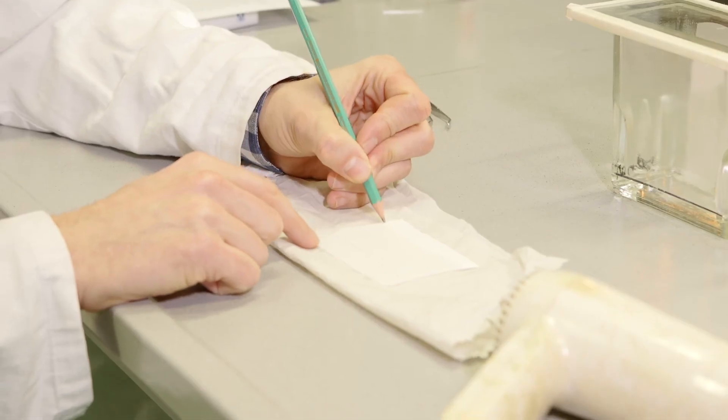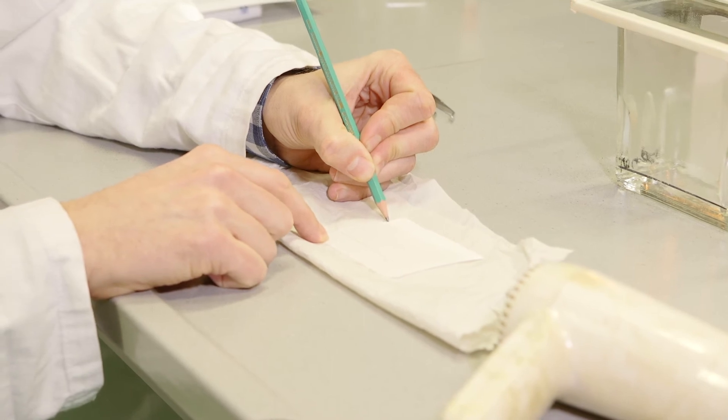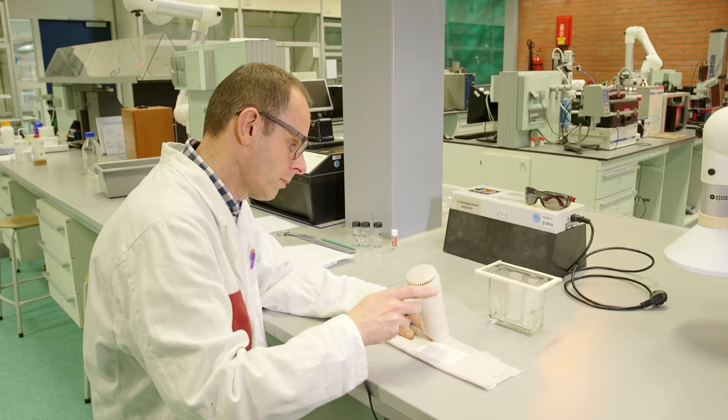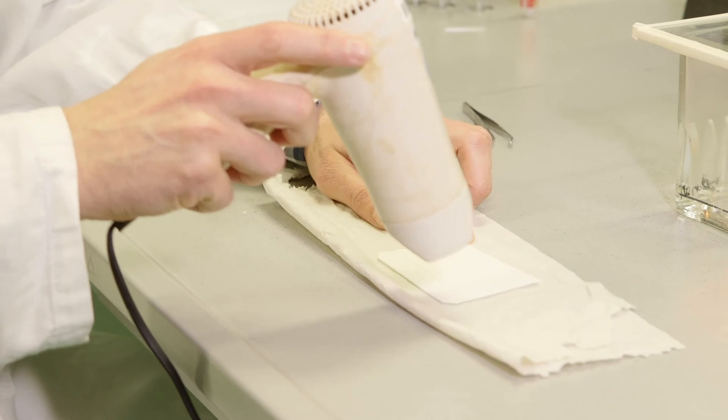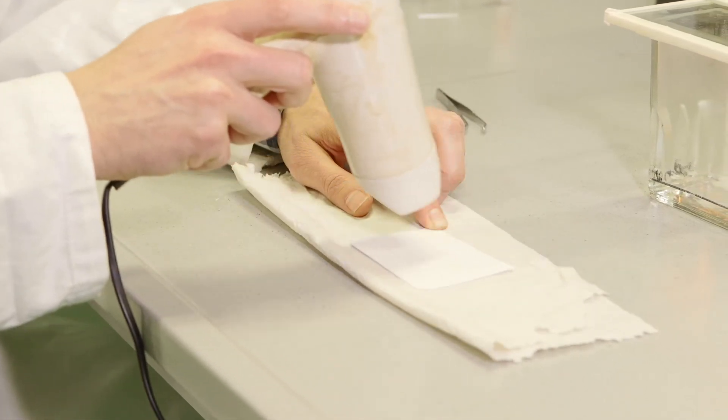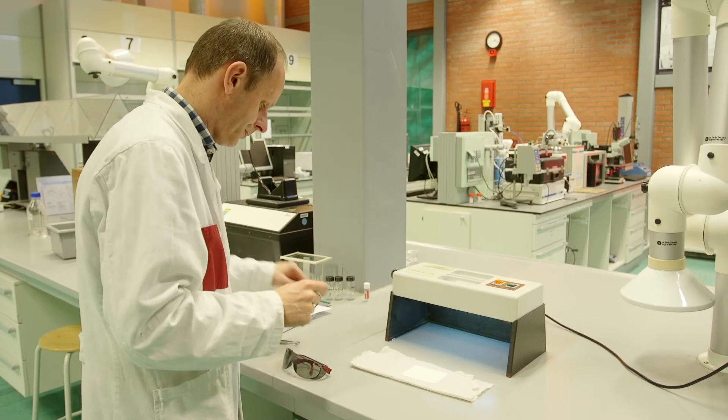The front of the solvent line is immediately marked with a pencil. This is important in order to determine the RF value. The plate must be dried. You can do this in the air or with a hairdryer.